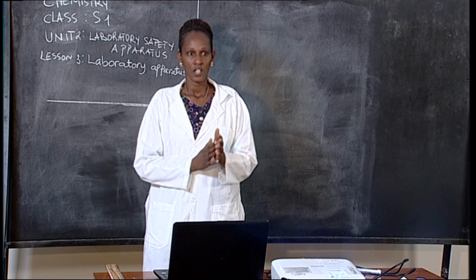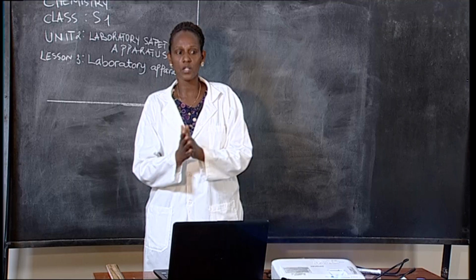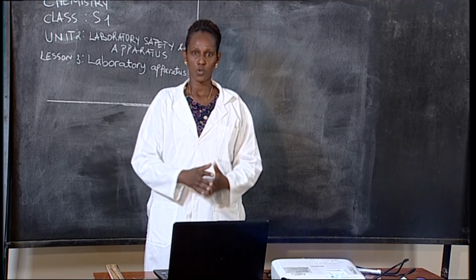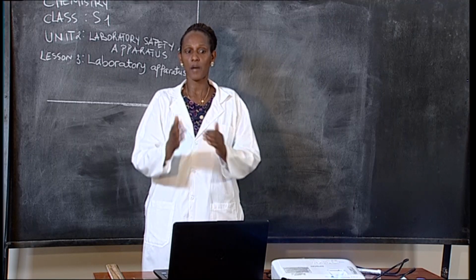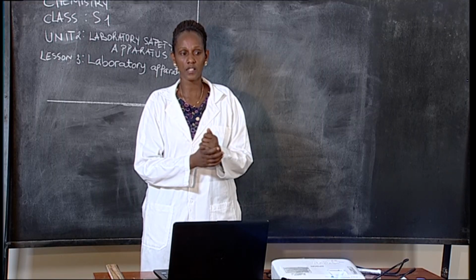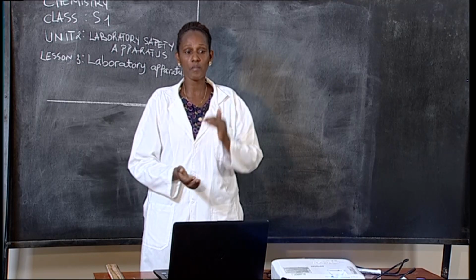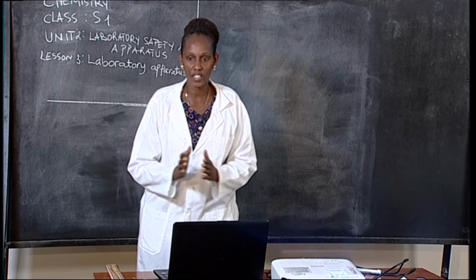All right? So what is the objective of our lesson today? Today we'll be able to tell the uses of common laboratory apparatus. We're going to look at some examples of the laboratory apparatuses and their uses. Another thing you will know at the end of this lesson is how to handle common laboratory apparatus effectively.